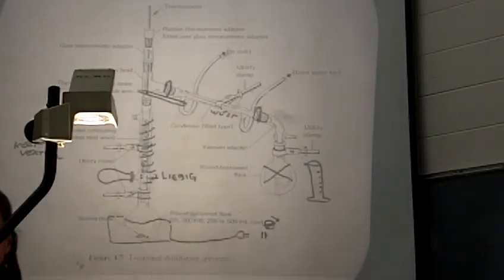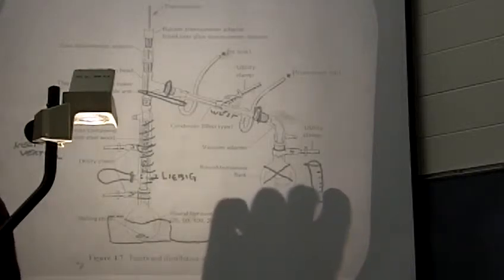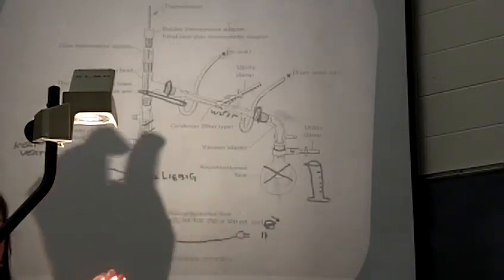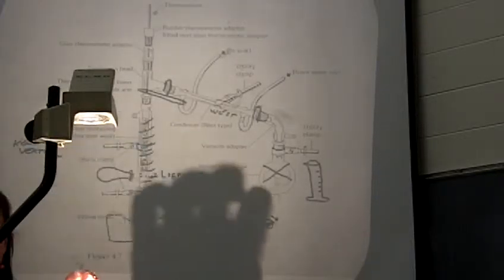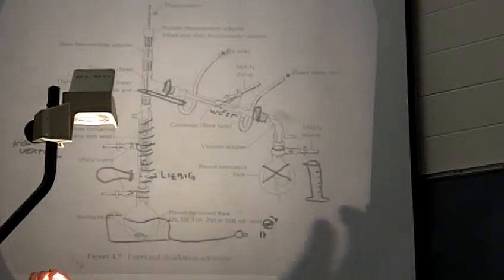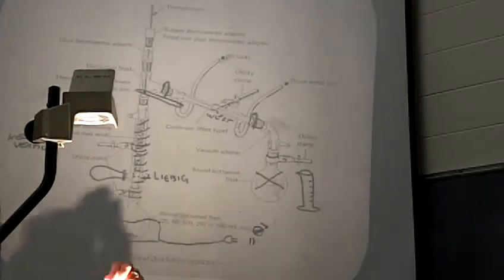The jacket of the condenser you also want to be free of water, because as you're heating your liquid and it's boiling and condensing in this column, you don't want heat expended to actually dry out and vaporize water in your column, okay? So the outer jacket of the column, you can use acetone on the outer jacket, rinse it out with acetone, and then connect one end of it to your vacuum line in your hood, okay? Put a piece of black tubing on it, connect it to the vacuum, and it'll help blow out your condenser so that it's completely dry, all right?